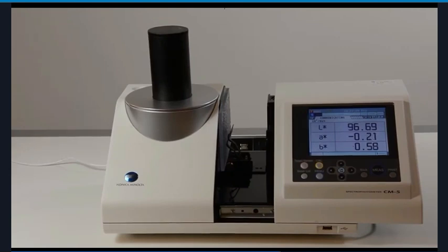After this, the black backing pop-up window will ask, are you sure to measure over black backing material? Click OK. And now we have our first sample measurement of haze.